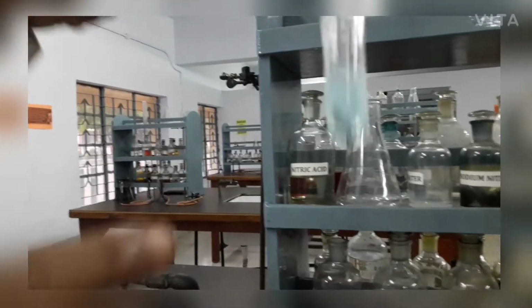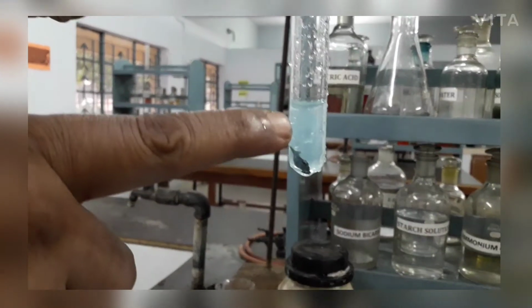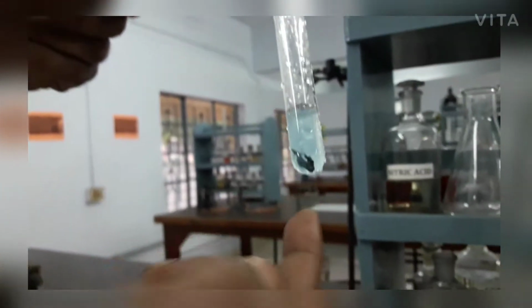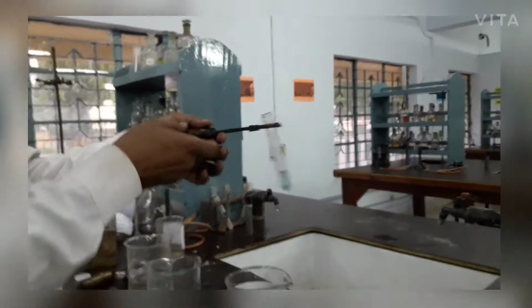So copper metal is deposited on the surface of zinc, and this solution, after some time, becomes zinc sulfate. Copper is deposited, and we see the color change of the zinc metal. Hence reaction took place. So here zinc is more reactive than copper.